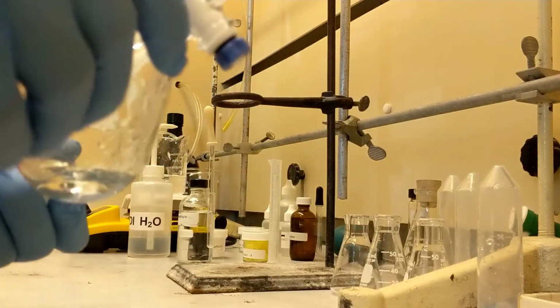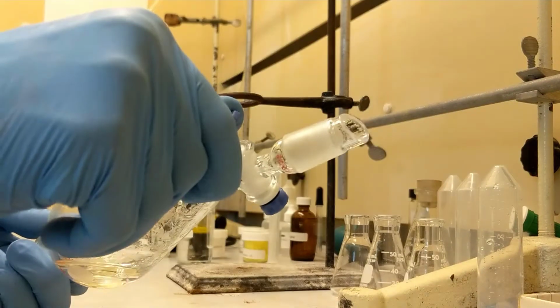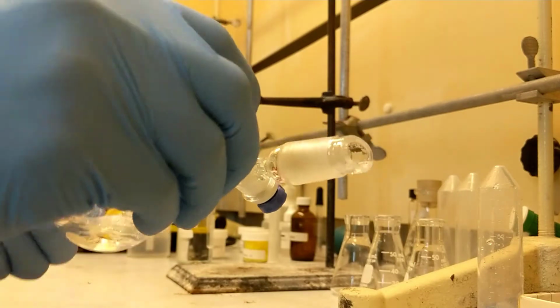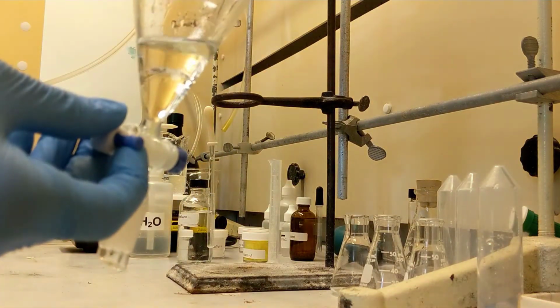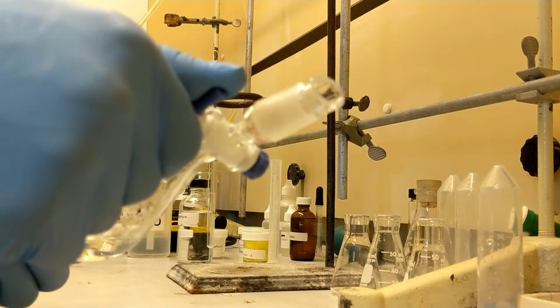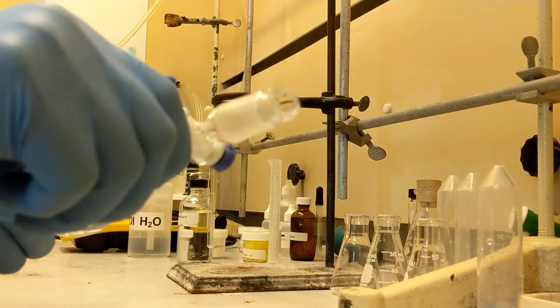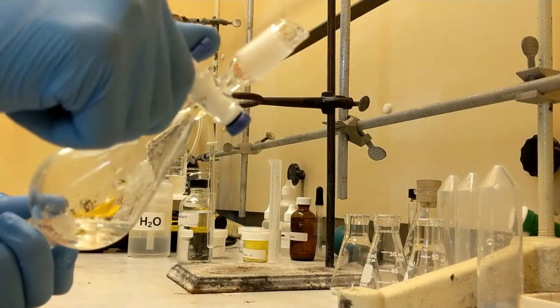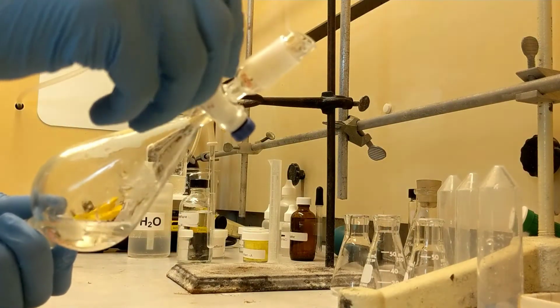I'm gonna invert it and release the gas. You guys hear that? I'm gonna do it again. Here, invert, release pressure. Hear that? I'm gonna do it again. There we go.